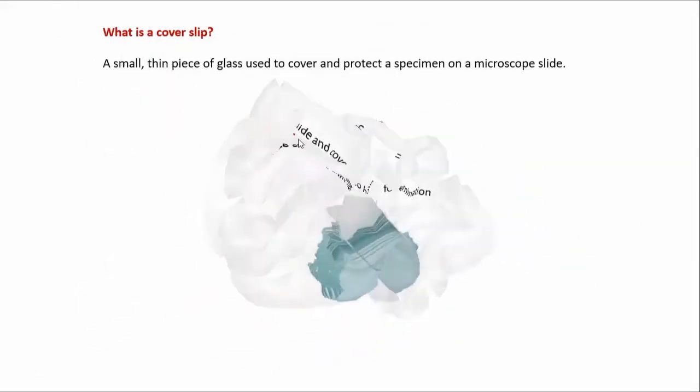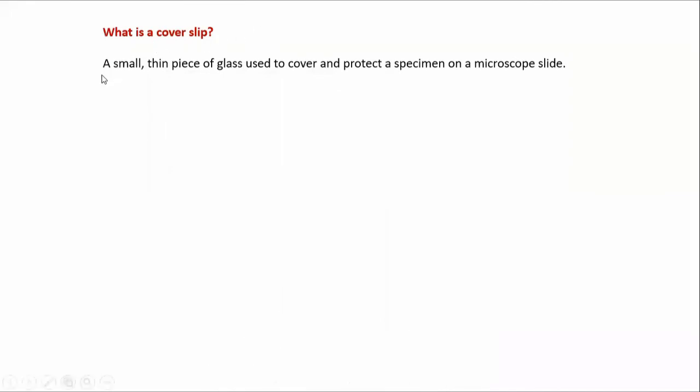Moving on, what is a cover slip then? A small thin piece of glass used to cover and protect a specimen on a microscopic slide.